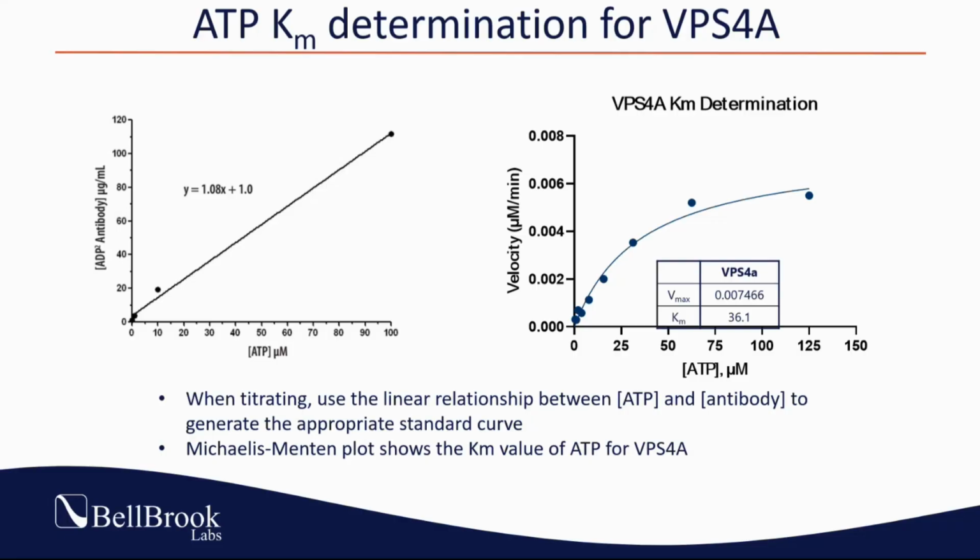And the reason for that, of course, is, as I'm sure many of you know, if you have ATP at a saturating concentration with respect to the enzyme activity, it's going to artificially introduce competition with the very compounds that you are trying to measure potencies for. And it will immediately interfere with your experiment. So you want to make sure that your enzyme reaction is running at or below this Km for ATP.